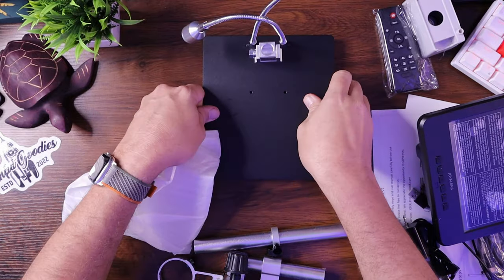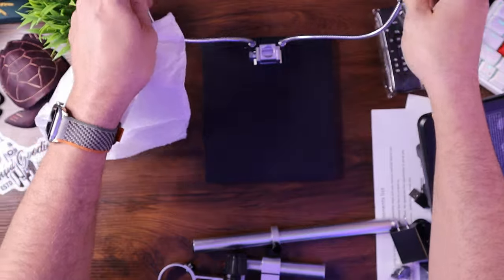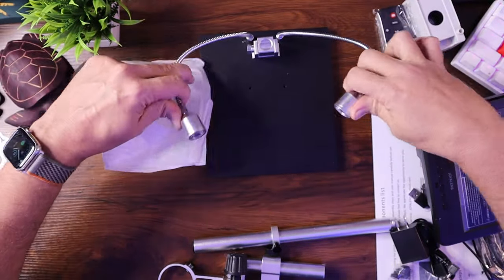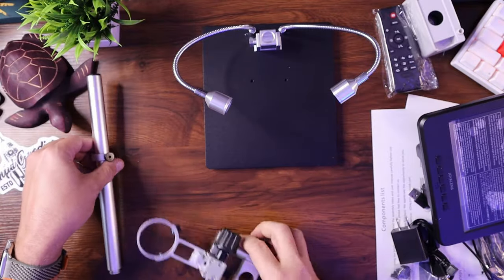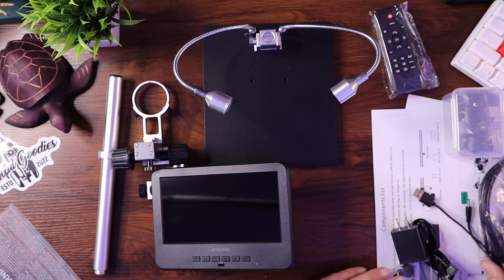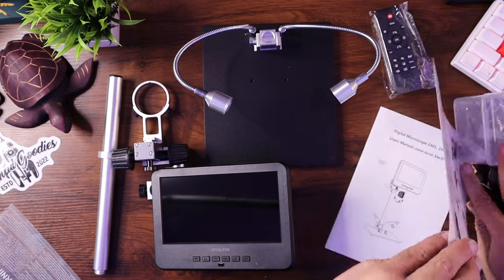All right, let's assess what we've got. We've got a base here with two small lights that you can bring around to shine on whatever you're working on. It's got two poles and the screen, then a bunch of doodads. So let's go ahead and see if we can pop this together and give it a try.